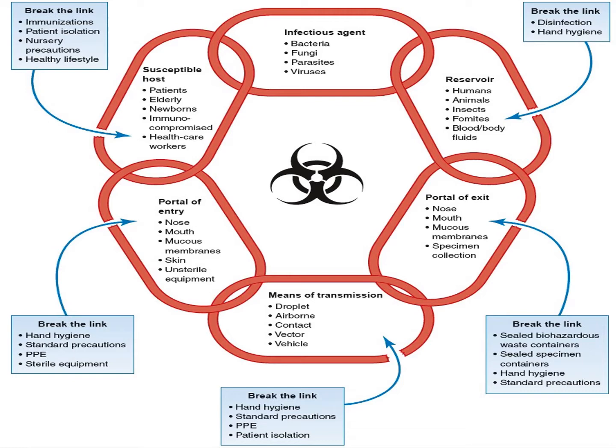So in order to break that component, for example, the portal of entry, the person must practice hand hygiene, follow standard precautions, wear complete personal protective equipment, and use sterile equipment. The same goes with your portal of exit. In order to break the link, we have to seal our biohazardous waste container properly. We also have to properly seal our specimen containers because that could also be a source of infectious agent. Practice hand hygiene and follow standard precautions.